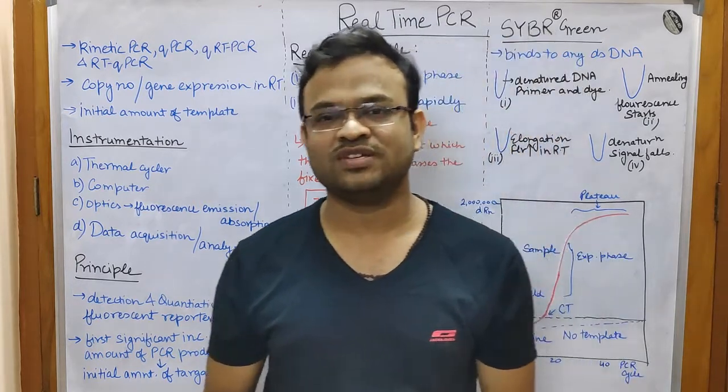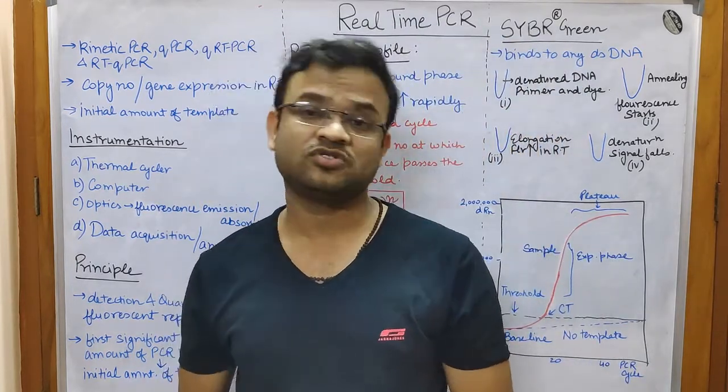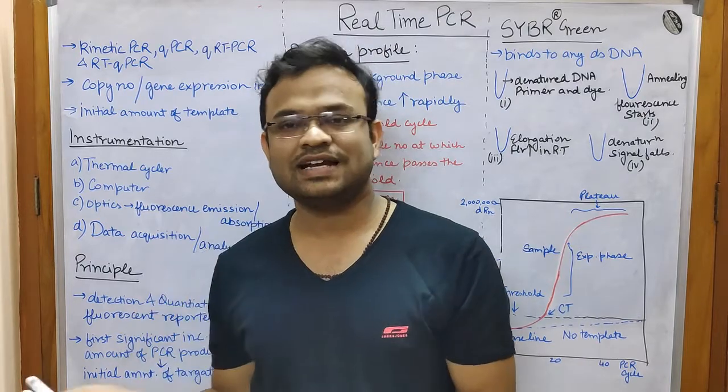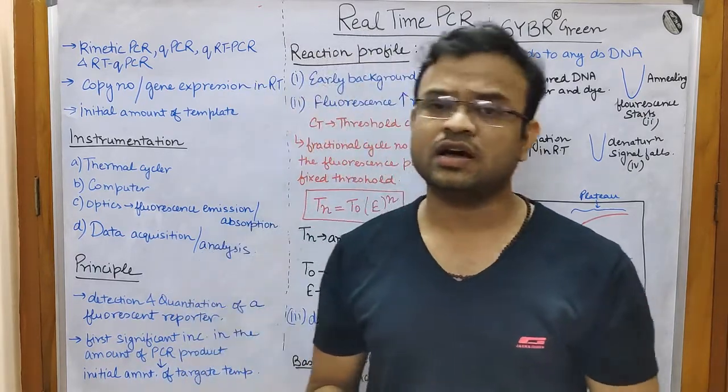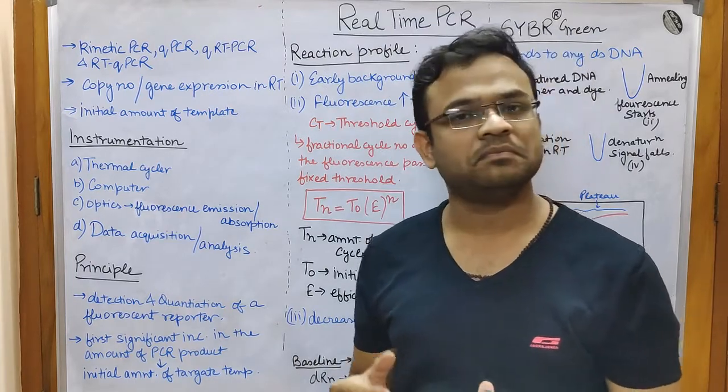The topic that we would be dealing with today is RT-PCR or Real Time PCR. Let us be sure about this. RT-PCR is sometimes also said to be reverse transcriptase PCR, but we here are dealing with Real Time PCR.